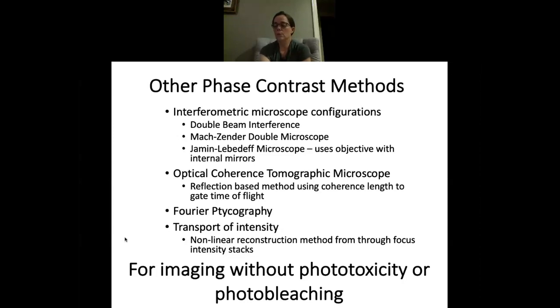However, fluorescent labels require many photons for excitation, either through high intensity or long time exposures, and they create a toxic environment. It's detrimental to the long-term viability of live cells that you're trying to study. And they will inevitably photobleach with repeated exposure and no longer be detectable over long time scales.